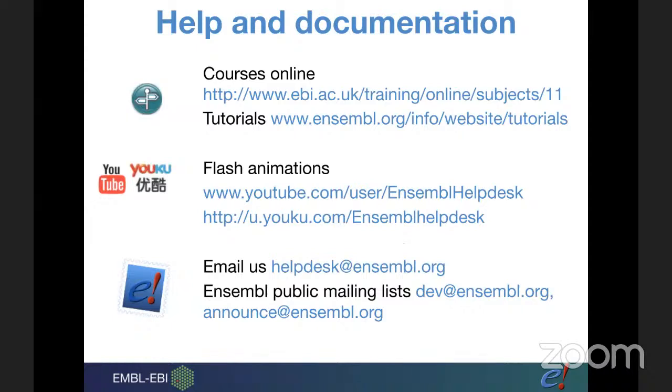The most important thing that I wanted to mention is where to find help on Ensembl. We have a lot of help and documentation available. You can also find longer courses, short tutorials and animations on the EBI pages and also YouTube.